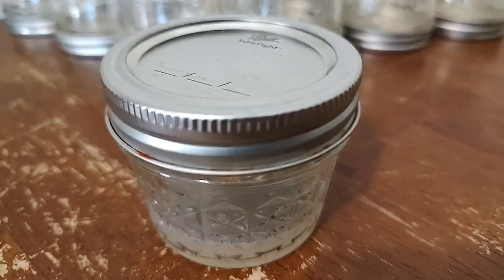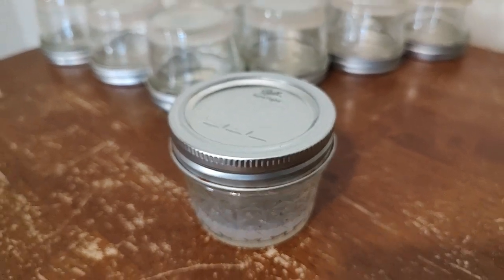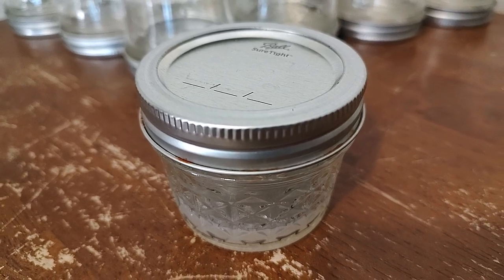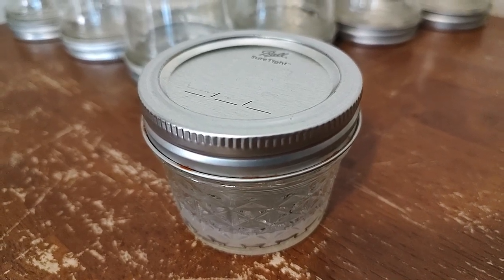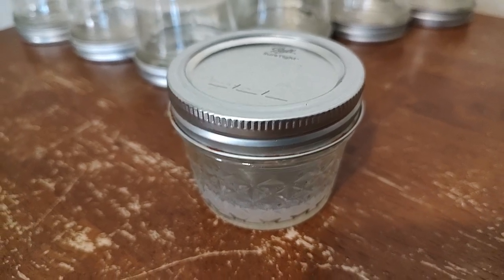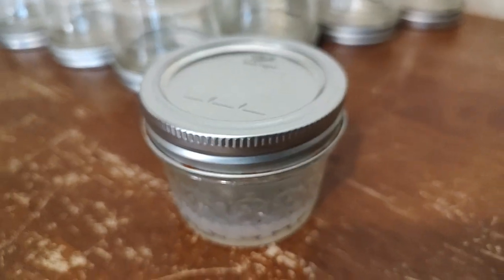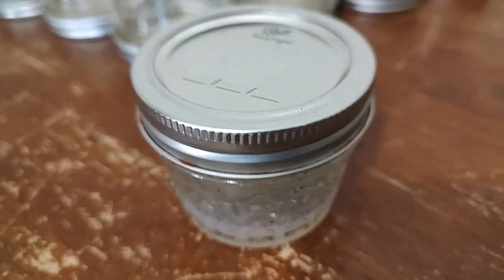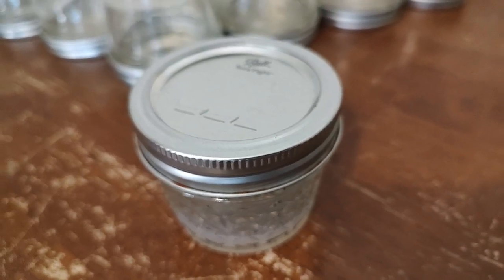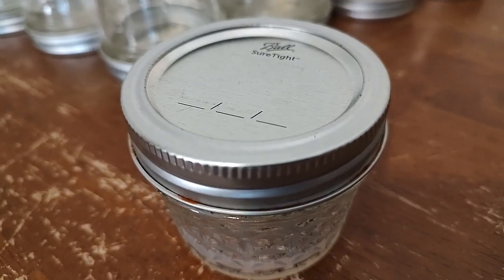Hello friends. I wanted to take a few minutes to discuss the lids on the no-pour jars. If you're creating these amazing, easy Petri dishes called no-pour jars — simply agar in a jar instead of a Petri dish — we've been having this conversation about flipping the lids, and I want to go into detail.